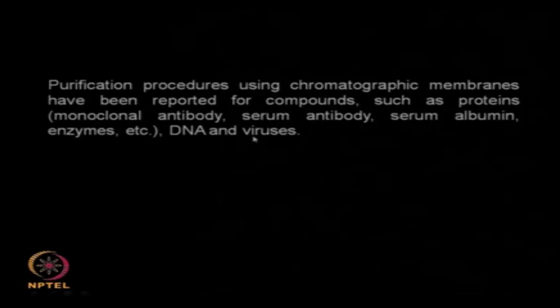Of course they have still not come into large scale commercial operation, they are still in the lab, but they seem to have quite good advantages when compared to the conventional chromatography, where we are talking about standard stagnant liquid film. So you are going to have different types of diffusions coming into the picture, which will slow down your process.